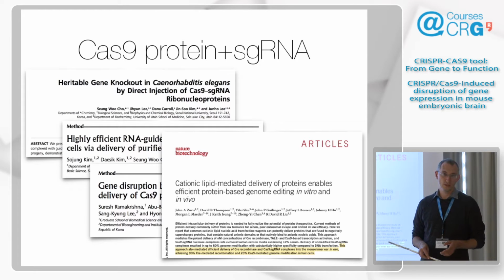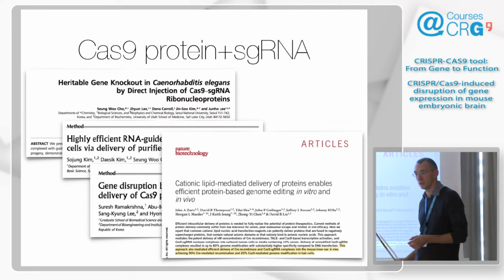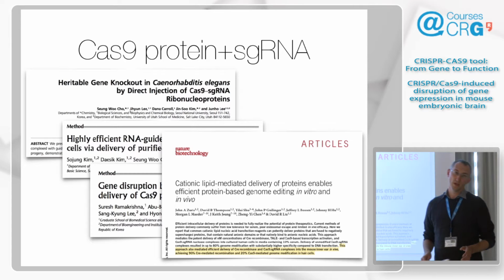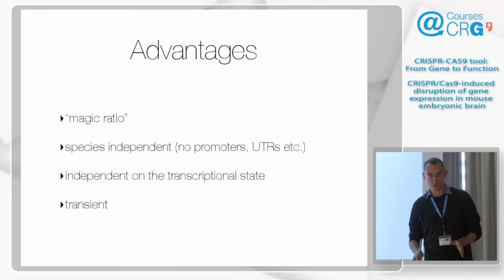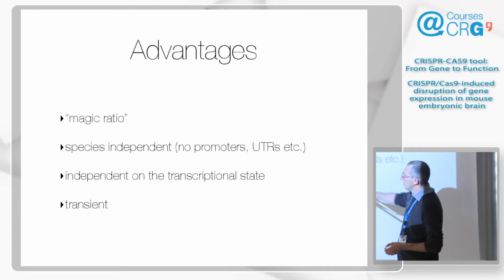We started with this around the time when we got ready to be seriously doing this. These papers started being published in which people did that. We tried it, we compared it with everything else, and we've been incredibly happy, and I can recommend it for any system because there are many advantages if you can use it. It's not always possible, but when you can, the first thing is the magic ratio.